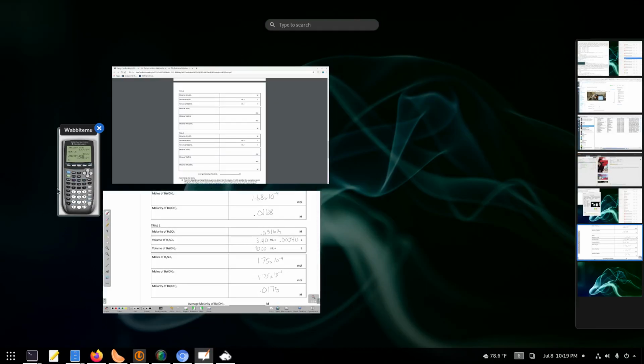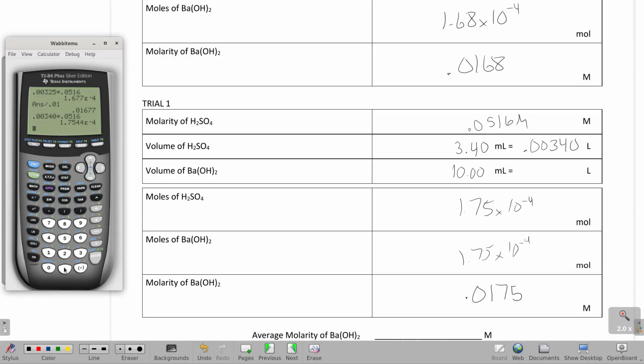But to average this, it is just to simply add those two up and divide by 2. So I'll take that and, oh, I didn't actually multiply it, so I didn't actually convert that. So 0.0175 plus 0.0168 divided by 2. I get an average of 0.0171. I'd be reasonably happy if the error is in that rounding digit anyway. So we're good.